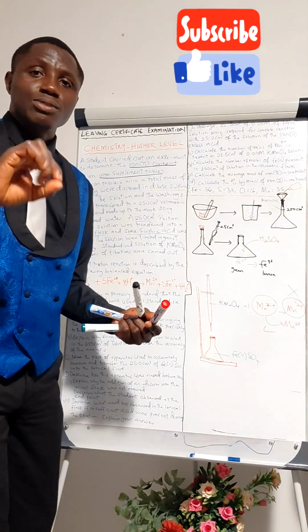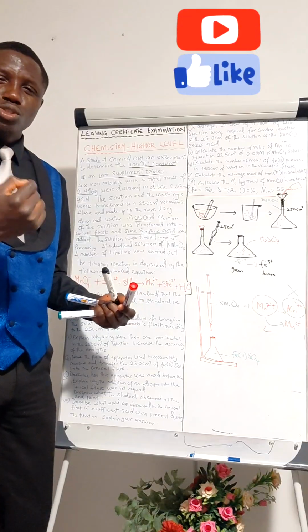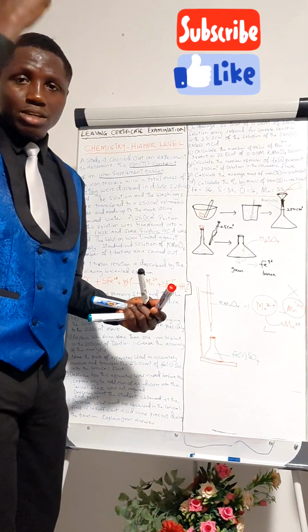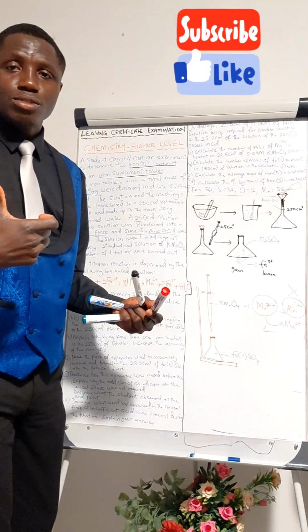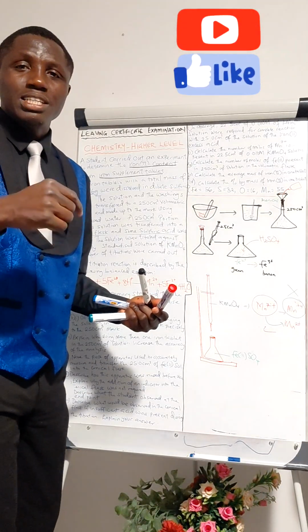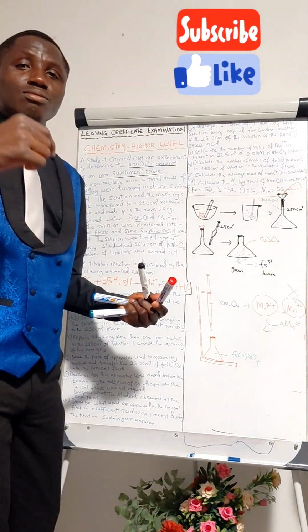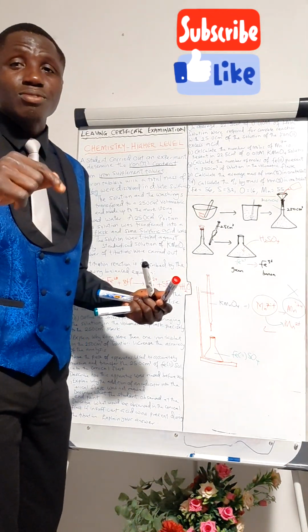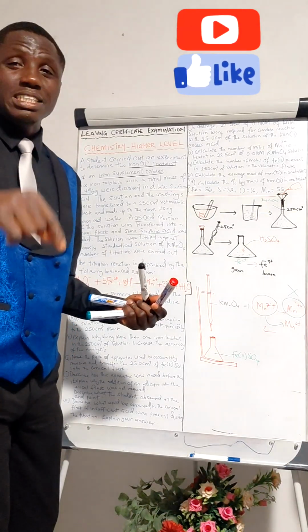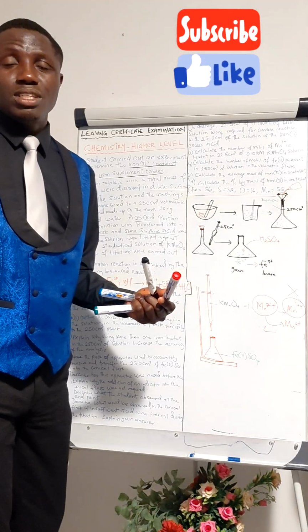You want to ensure that the water is removed, so you use part of the solution you wanted to pipette out to rinse the pipette again by drawing it in and then pouring it out, to ensure that you don't have excess water inside. The water can add to the volume of the transferring liquid you are trying to use for the experiment, which might affect the determination of the iron content of the experiment.